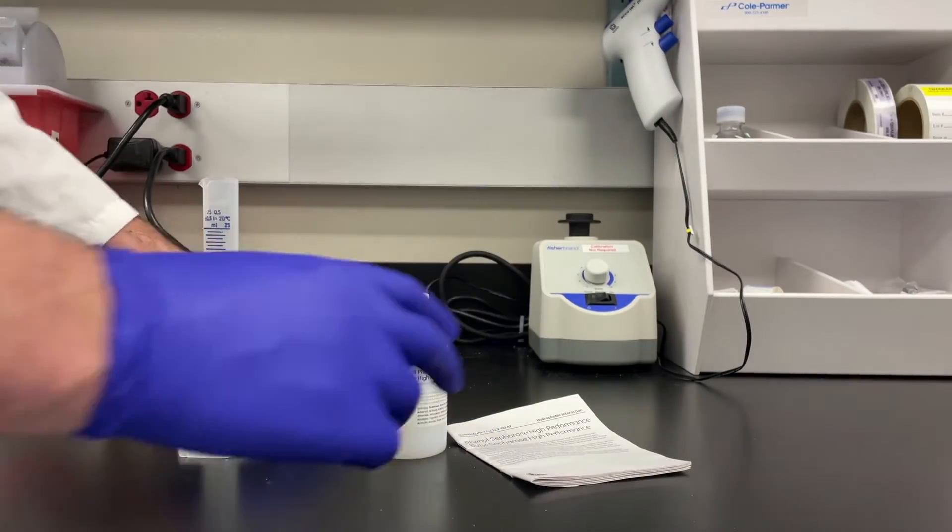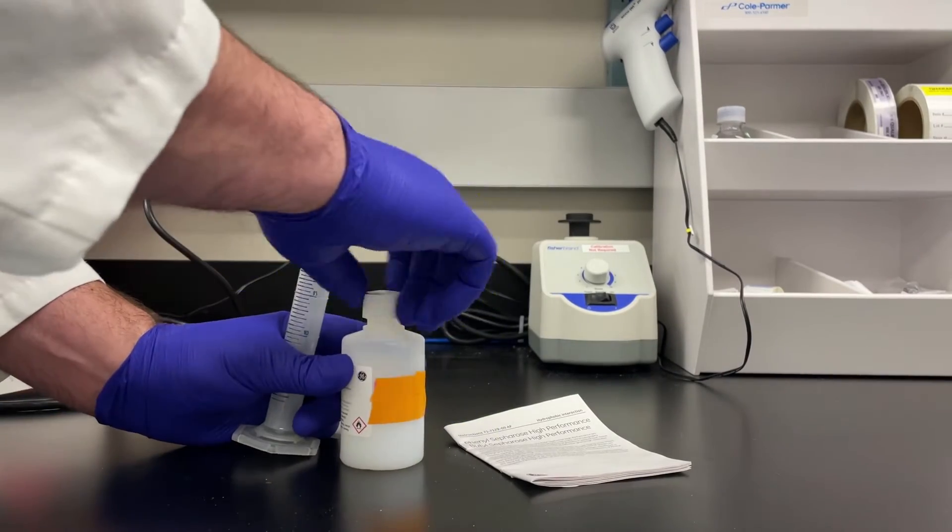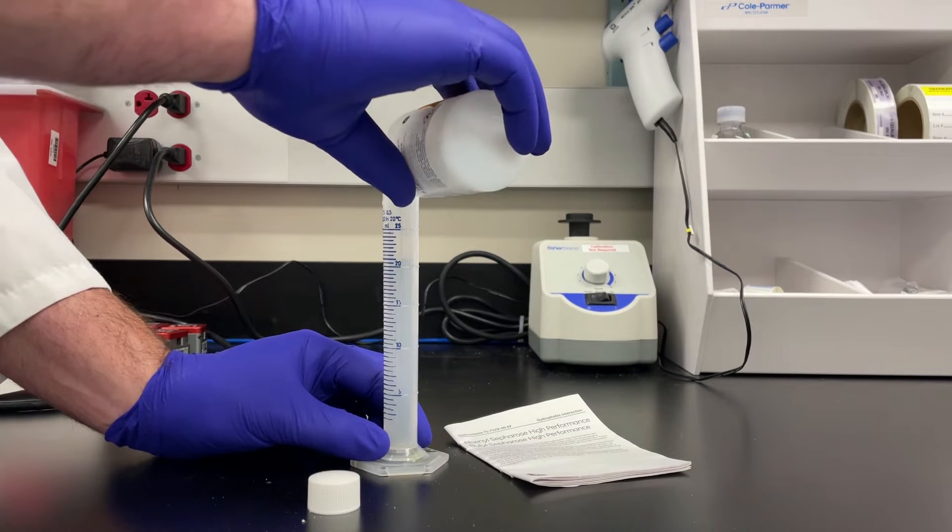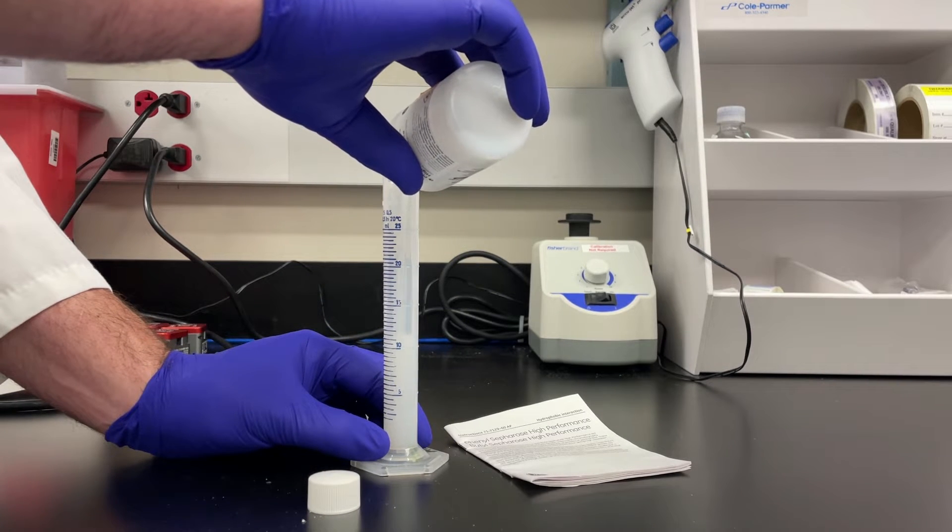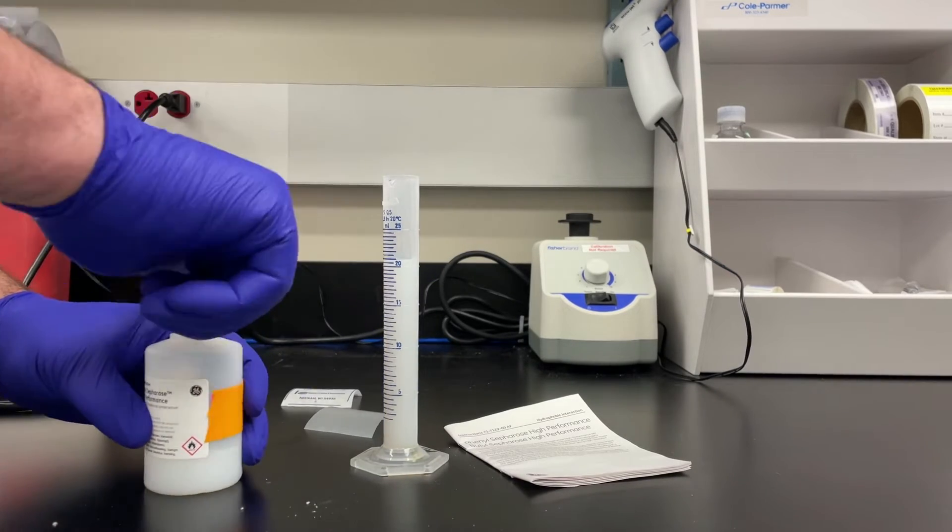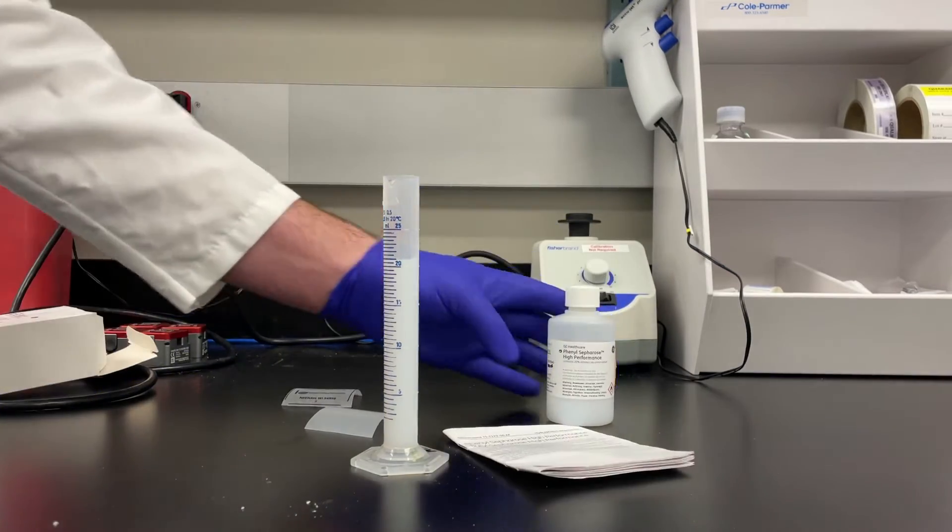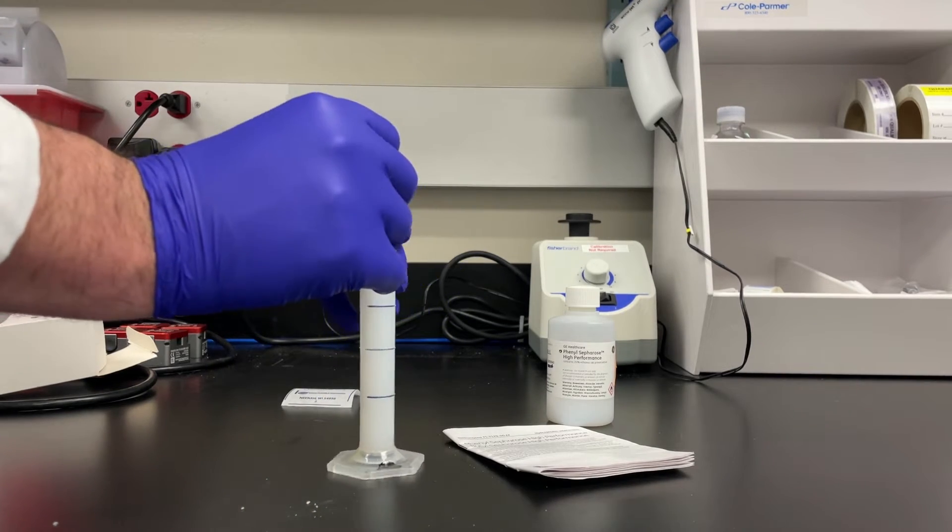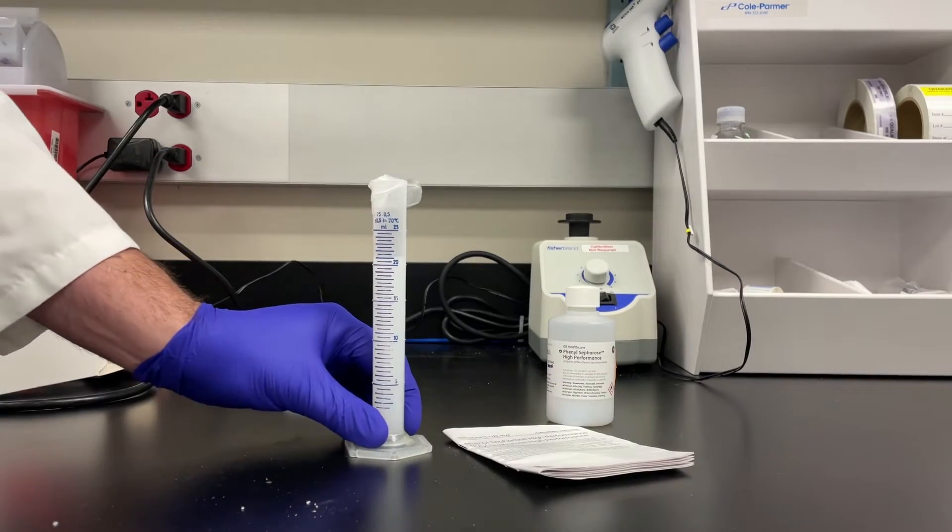Once we've finished resuspending the resin, we have a slurry. We're gonna pour about 20 mils into a graduated cylinder. It doesn't matter whether I get 20 mils exactly or not. I'm just gonna divide one number by the other and let this settle overnight so I can see what the percent solid versus liquid is, and that'll be my percent slurry.